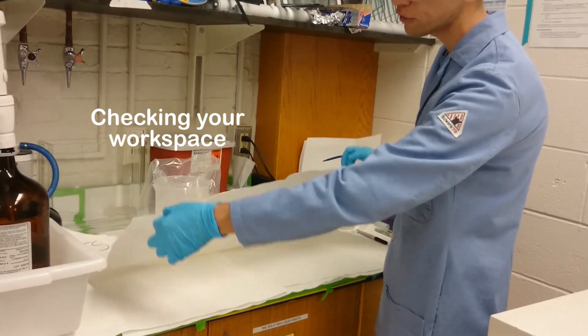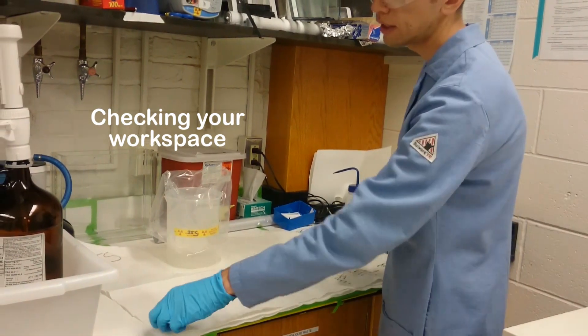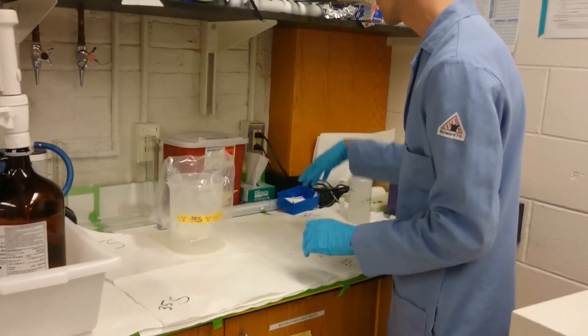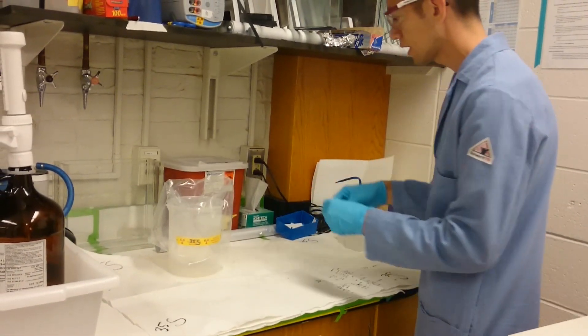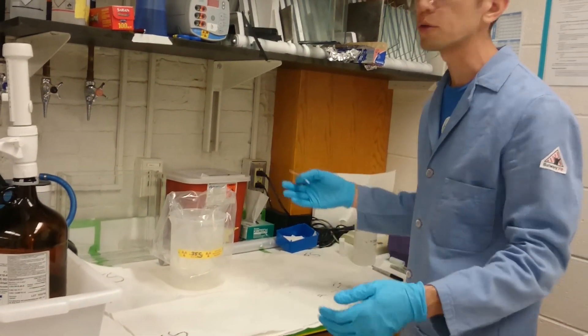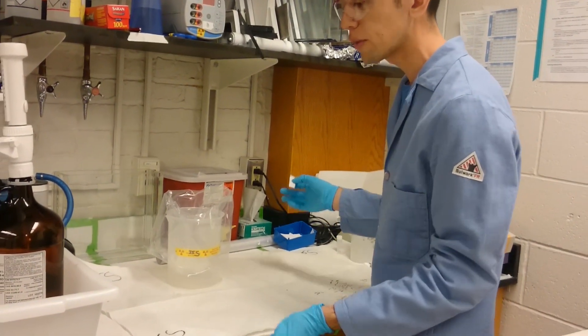Whenever you're working, you should always have an additional piece of bench paper down that's labeled with the isotope that you're working with. If this ever gets hot, you can fold it all up, put it in the waste drum, and get a new one. Otherwise, you can reuse it.